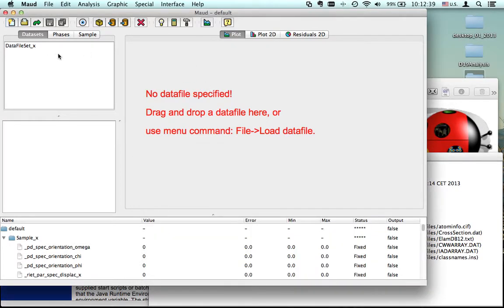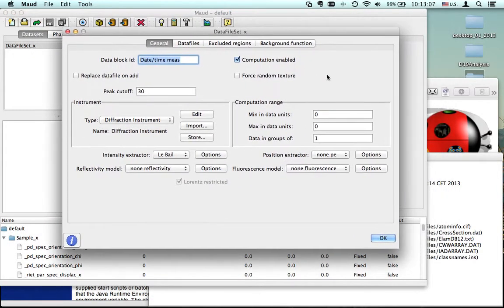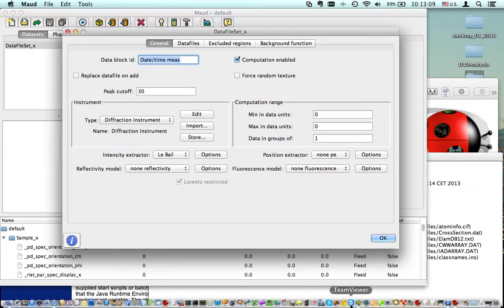Now, let's go with our analysis. Then we see some new features during the running of the analysis. Apparently, nothing has changed on the interface, or very few changes. Most of the work has been done on the inside, on the core of the program. Let's go to the dataset now. What we need is actually, we will work with D19 data.